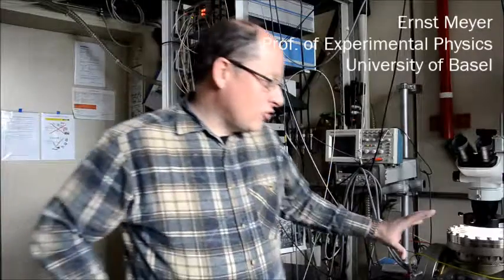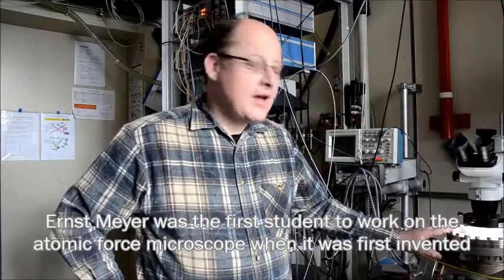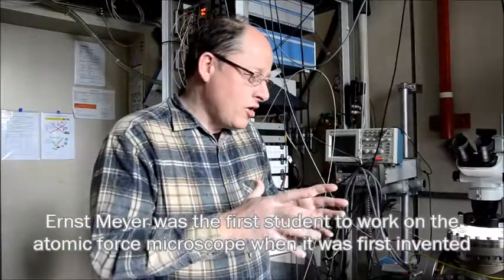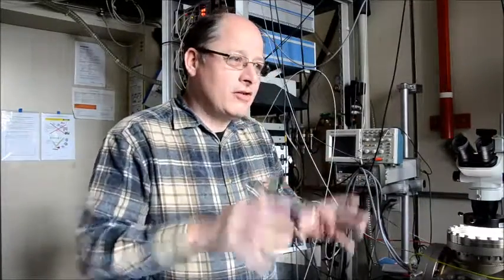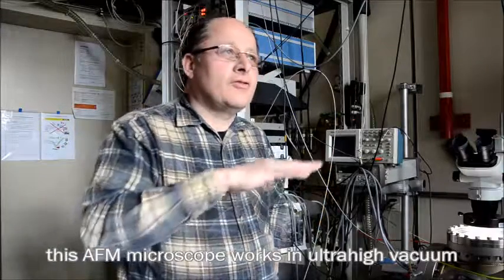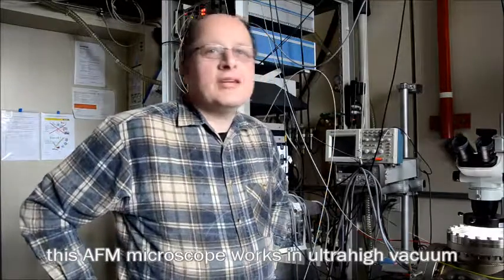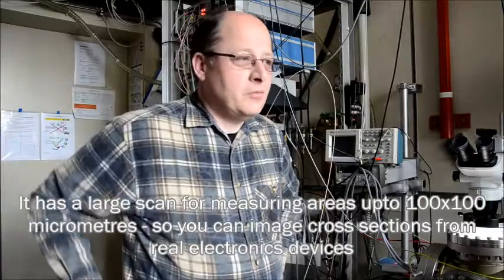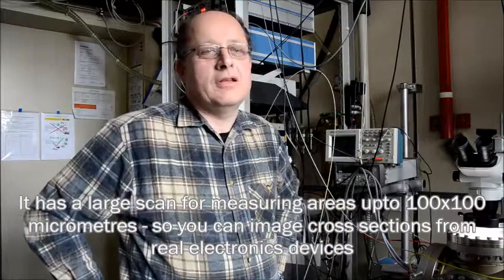Okay, so I can show you here a microscope. It's an AFM, which is working in UHV, in ultra high vacuum, and it has a large scanner. So basically, you can also measure areas up to 100 by 100 micrometer, and by that you can also image cross sections from power devices, from real devices which are used in power electronics or in the industry.